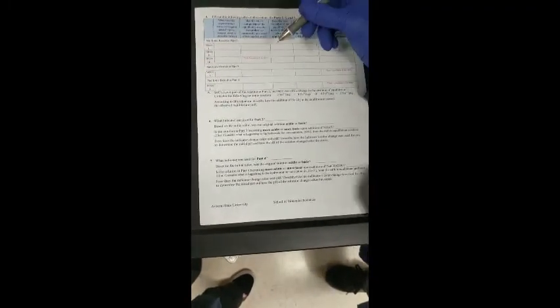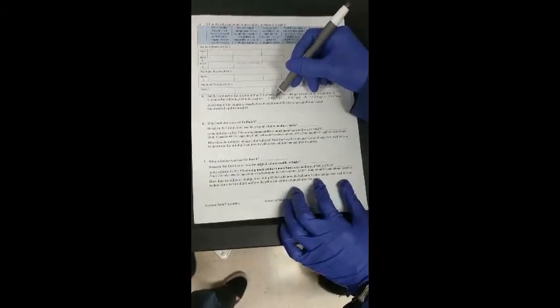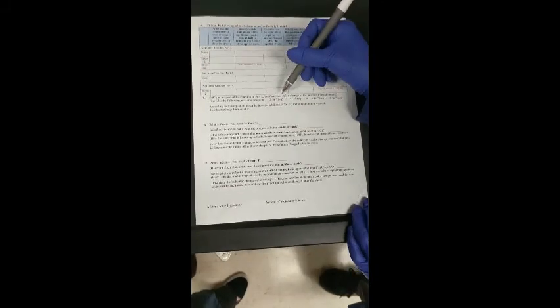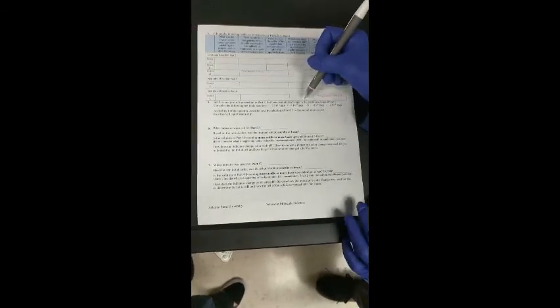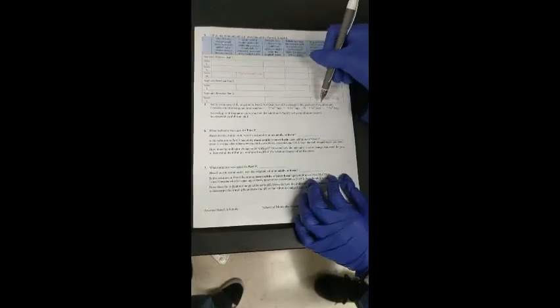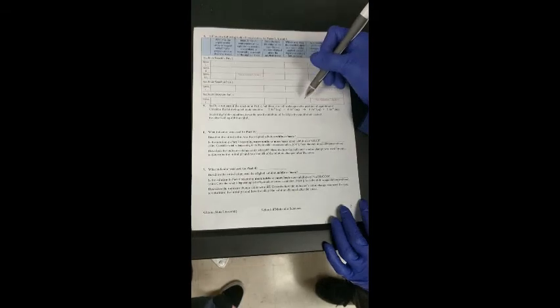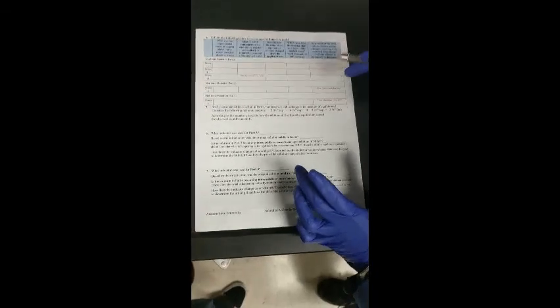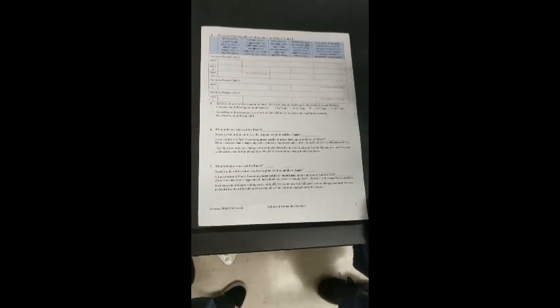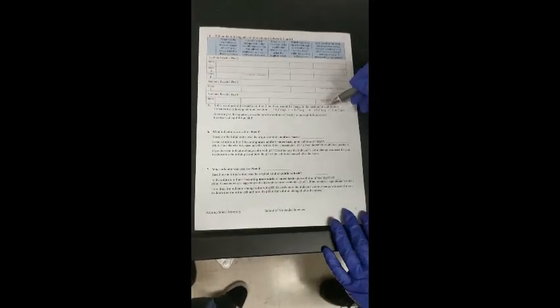In Stress 3, you put some tin chloride solution. This is kind of tricky, but please read this sentence. Tin(II) chloride has a tin(II) ion, and it's a reducing agent that reduces iron(III) ion into iron(II) ion. So in this case, iron(III) ion is removed from the equilibrium system, and as a result, the equilibrium will shift. Please explain the color change of the solution based on this experimental procedure.